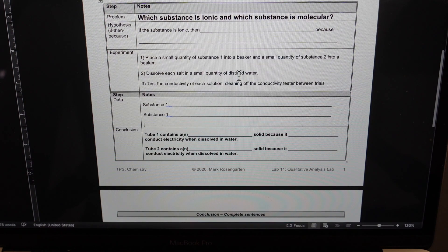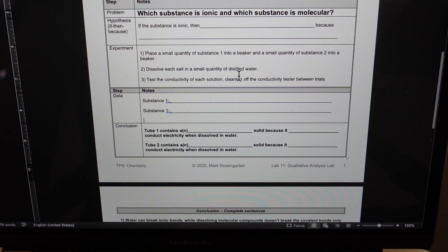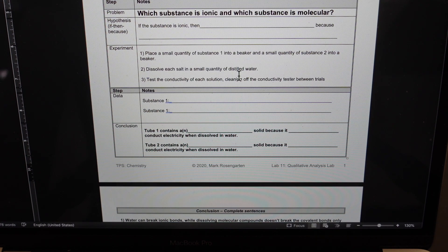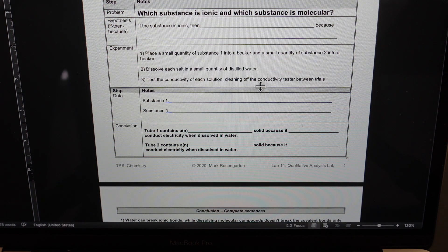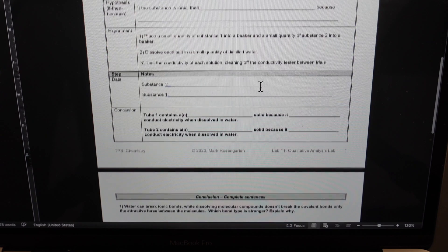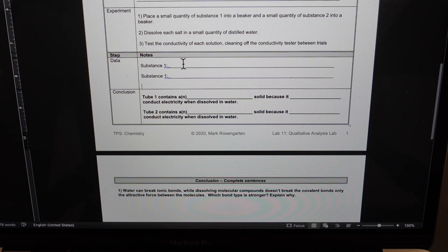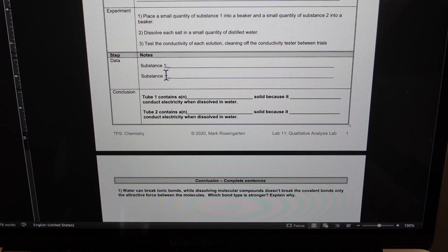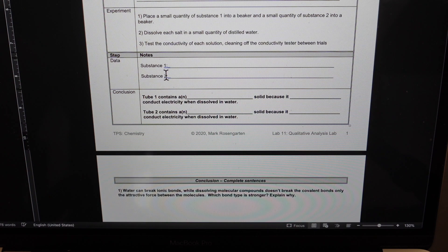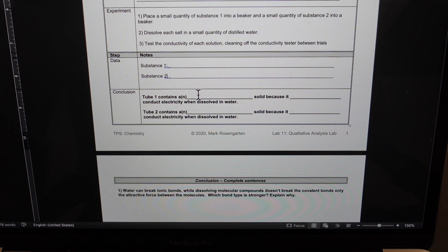Then you're going to place a small quantity of substance one into a beaker and a small quantity of substance two into another beaker. Dissolve each salt with a small quantity of distilled water and then test the conductivity of each solution, cleaning off the conductivity tester between each trial. You will collect data as to whether substance one conducts electricity or not and whether substance two conducts electricity or not.